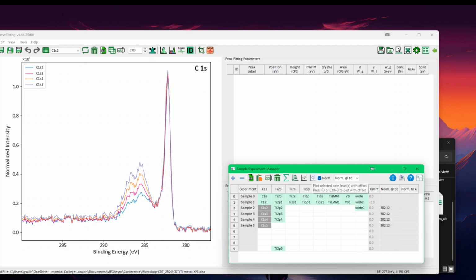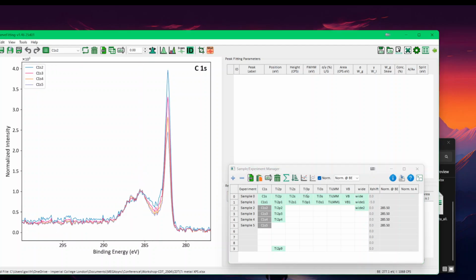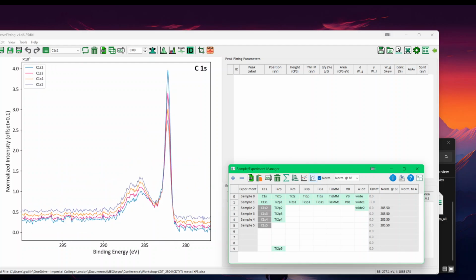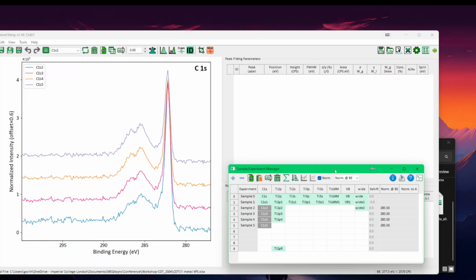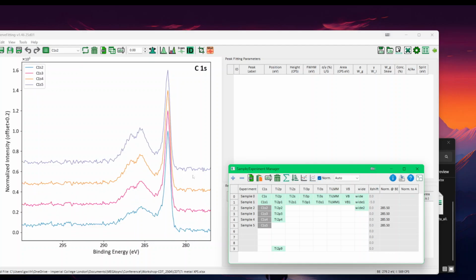And again, even though it's been normalized to this value, let me go back again. Even though it's been normalized to this value, I can just press the F3 button. If I press once, it's just a small shift. If I press twice, it's slightly bigger, then 3 times, 4 times, and that way you can see the differences. It's slightly bigger when you do auto, because now it's looking at the max, so I think it will do a 10% shift, as you can see. So if I do double, it's 20% now. So you get the idea.